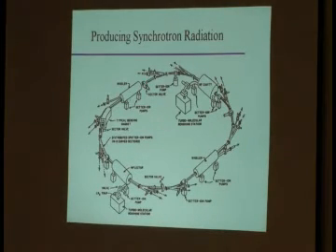You also have a whole bunch of vacuum pumps around here, different types. Because if your electrons were flying in air, how far would they make it? Until they hit the next atom, right? And that would not be very far. So you need to keep things under vacuum if you want to have a stable electron beam.